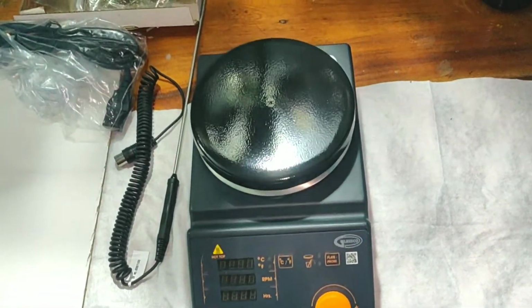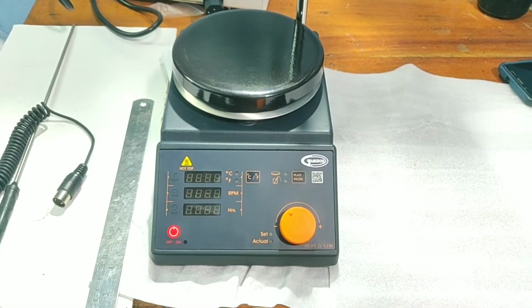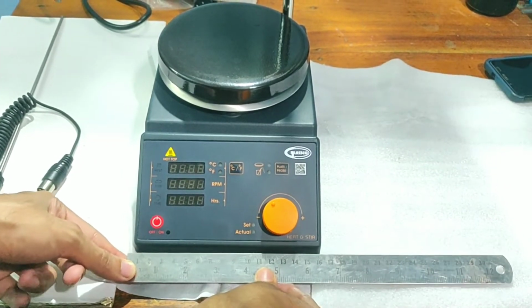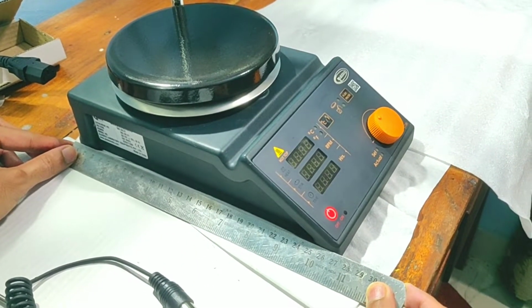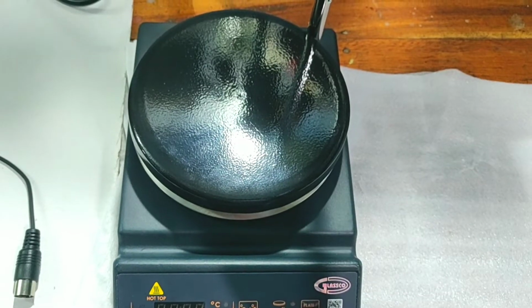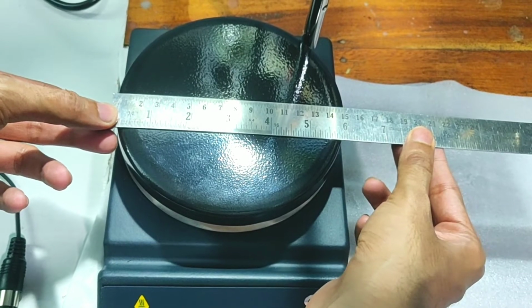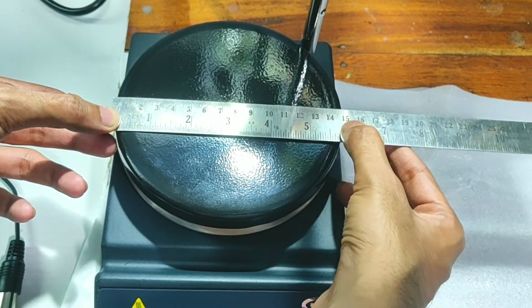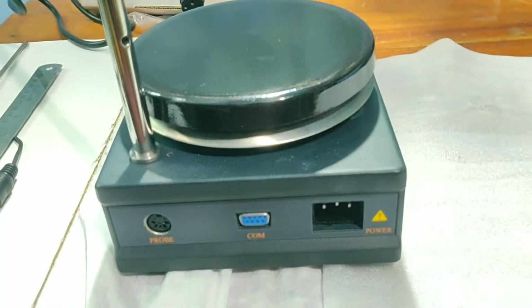Now let us see the actual hot plate itself. So this is a hot plate combined with a magnetic stirrer. It has this aluminium molded body and it has a width of around 16 centimeters, a length of around 26 centimeters and a height of 10 centimeters. The hot top is made up of stainless steel but coated with ceramic to make it resistant to most chemicals and also scratch resistant. The hot top is around 14.5 centimeters or roughly 15 centimeters in diameter, which is actually very big and can hold a 2-liter beaker on it.